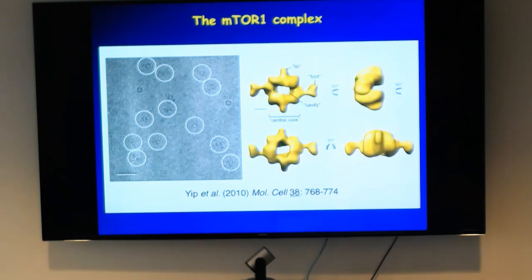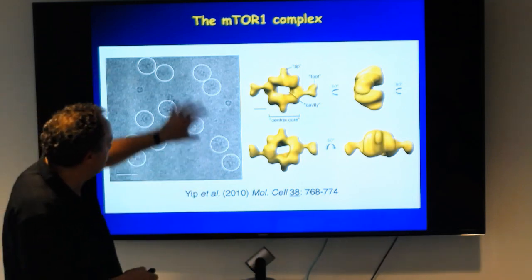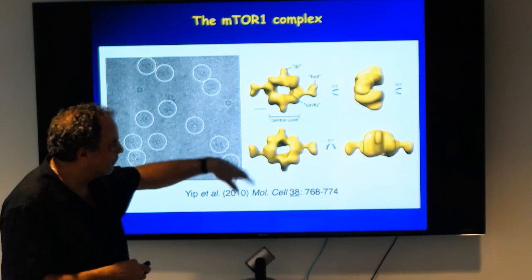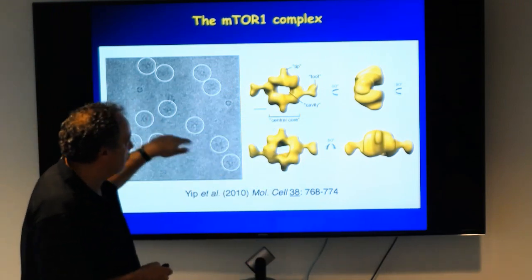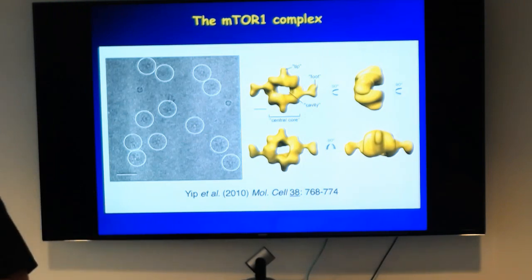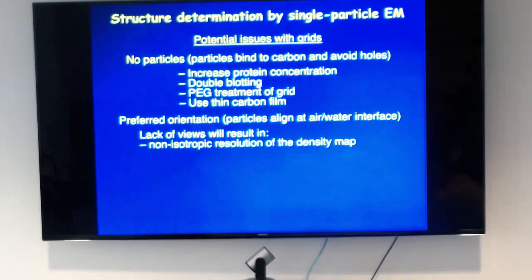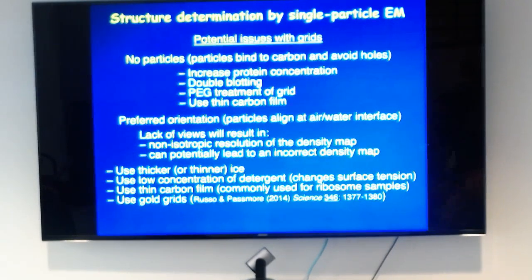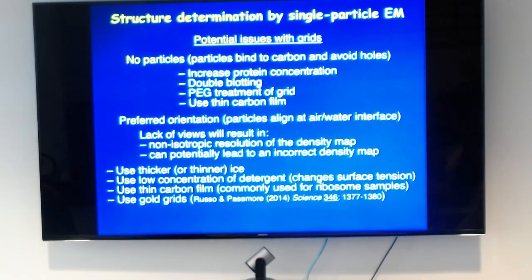And so what happens is that in the view that you have on your grid, you can actually nicely see the different features. But perpendicular to this, there's virtually no distinction. It's just one. So you could almost just take your 2D average and spread it out, and you would have the same structure. So that was a problem. But there are again all kinds of different ways, and these are just a few of the ways that you can fix the problem.